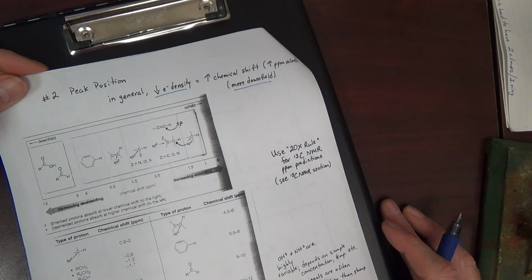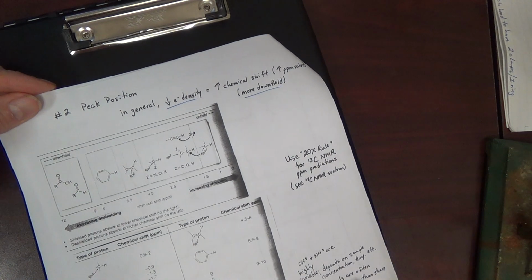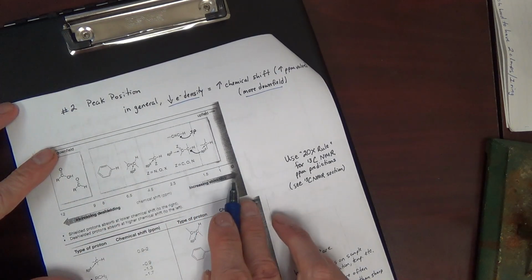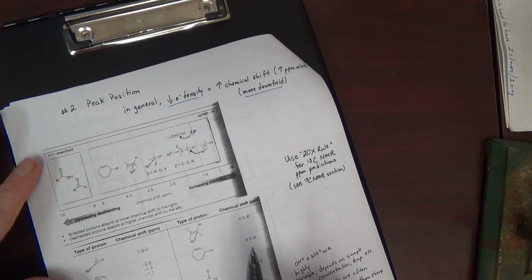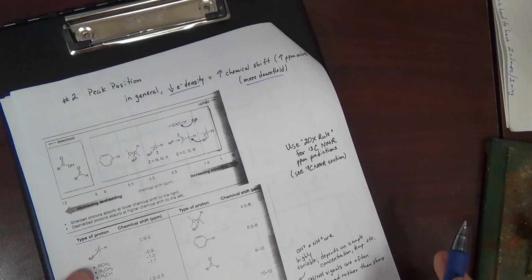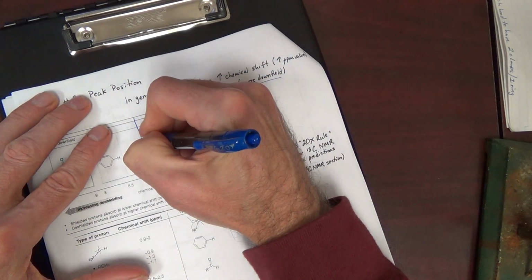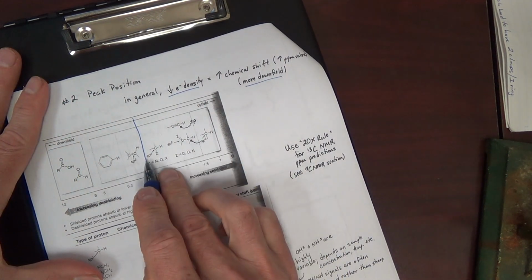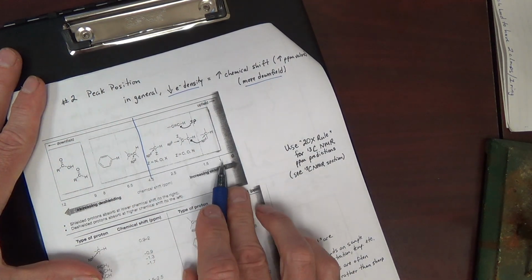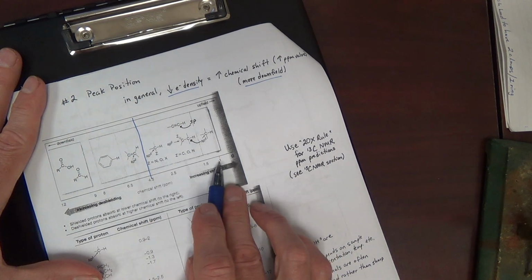Ultimately, let's just go through the tables of peak position. This is a general table of proton peak positions, and this is a little bit more specific. In general, H's that are on sp3 carbons are going to be in the range of about 1 to 4.5 ppm.